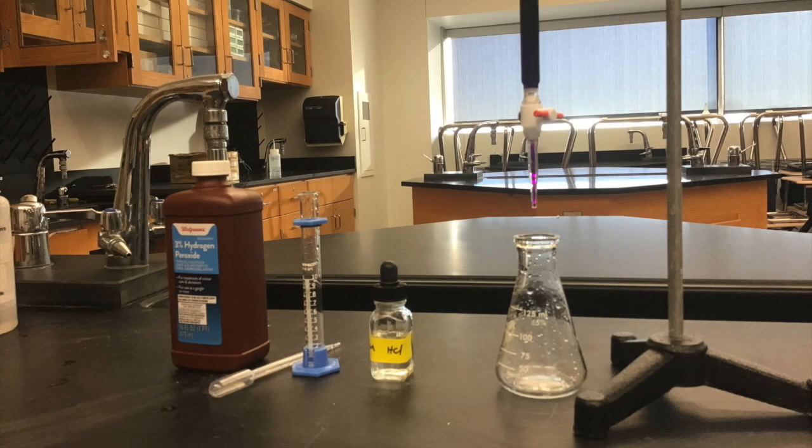Hey everybody, welcome to lab number seven. In this lab we're going to do a redox reaction, and the way we're going to do this is we're going to mix together two substances.